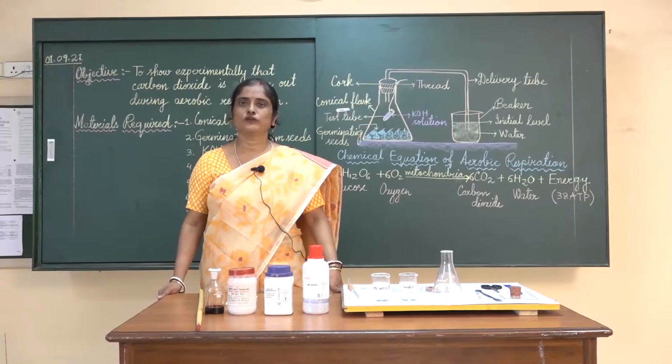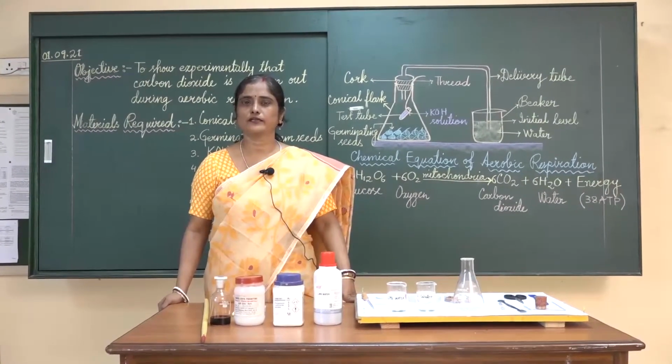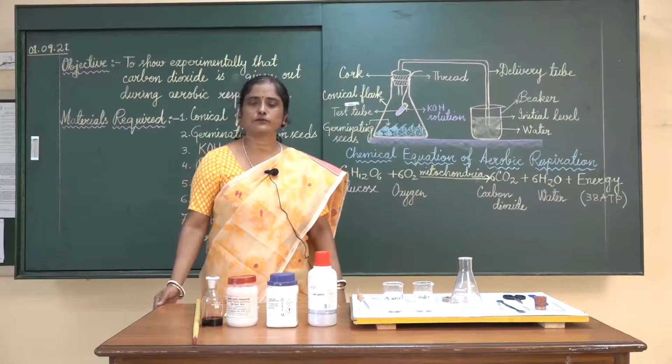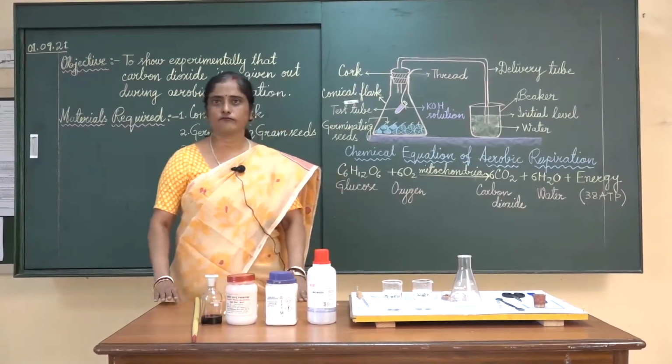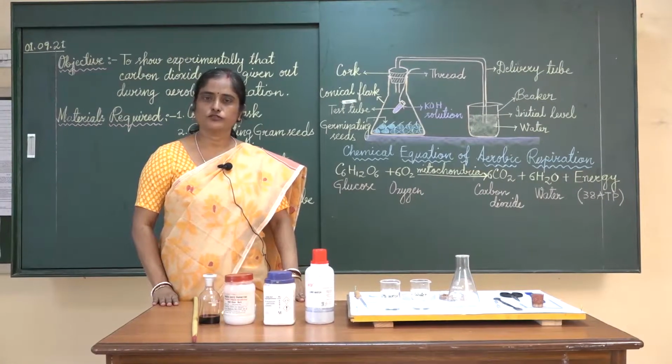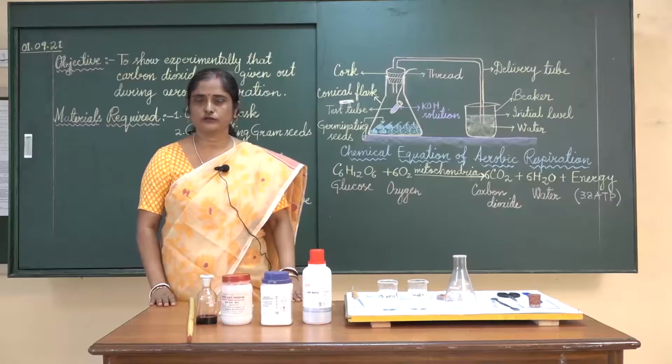Hello students, today we are going to discuss a practical from the chapter Life Processes, the first chapter in biology in class 10, right. So, there is a very important life process, it is known as respiration.